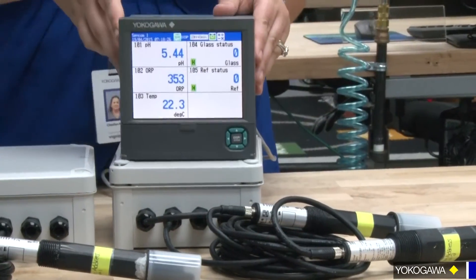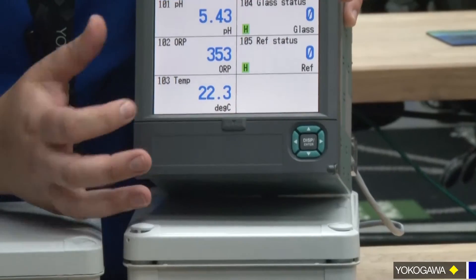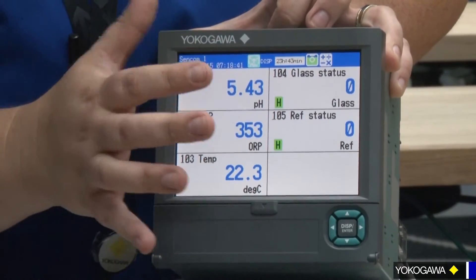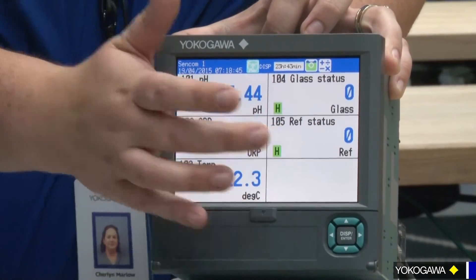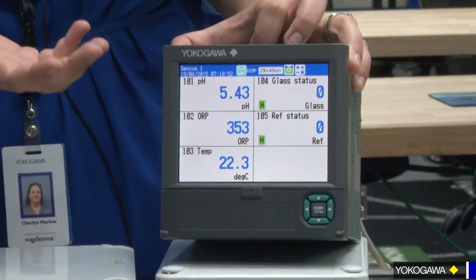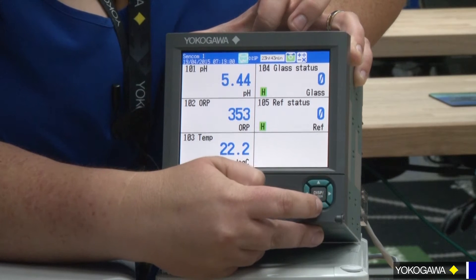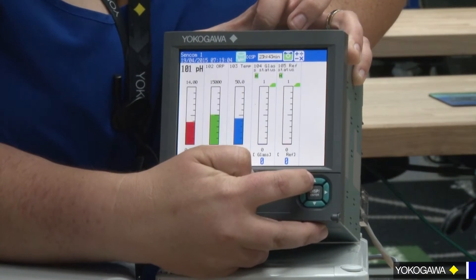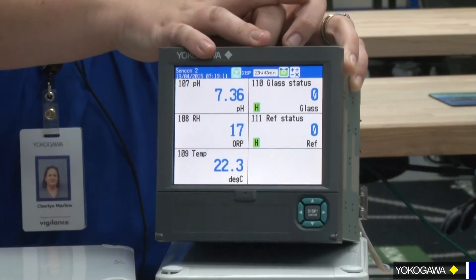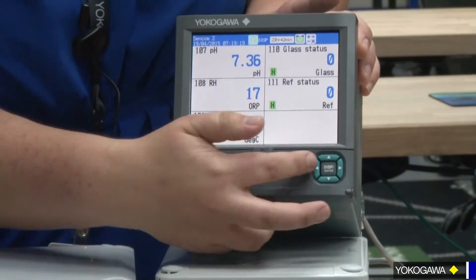Now let's take a moment — I want to show you the FX by itself and its operation. Here you can see pH value, ORP value, temperature value, and what we've also selected pre-programmed in here are the glass impedance values and your reference impedance values. Those are important for, A, your coating — so you see when you need to clean — and B, your reference impedance, when your junction is getting clogged and needs to be cleaned, or your reference probe is dying. You can scroll easily through up or down, you can have trend graphs, you can have bar graphs, and then you have the capability to connect four sensors to one FX, based on the amount of math channels and comm channels that you've selected when you bought your model. Very simple, very easy to use.